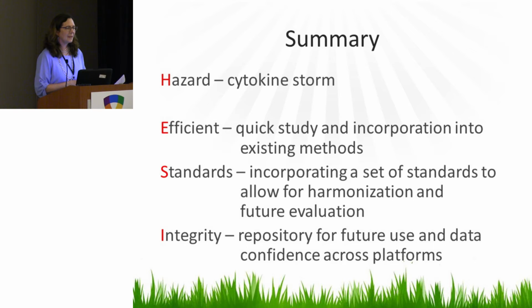So thank you very much. It was an excellent summary, and the work of this committee is one of the reasons that our company continues to re-up every year. Two questions. You mentioned lack of predictivity, and I'm wondering if you meant absence of signal completely or inability to predict the sensitivity of the species. And then related to that, if that's true, are there any examples with CD28 or any other molecule where you can replicate a difference in species sensitivity with an in vitro cytokine release assay?